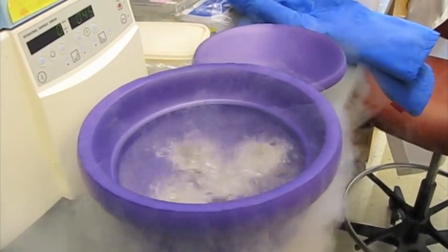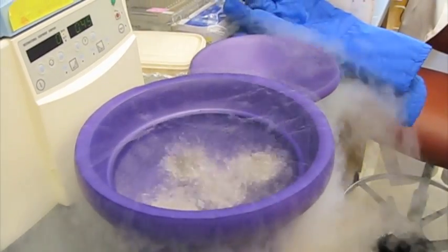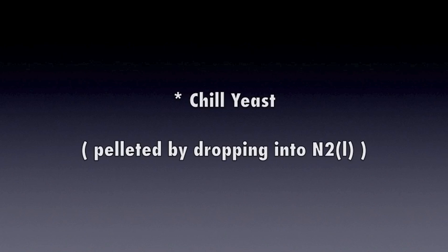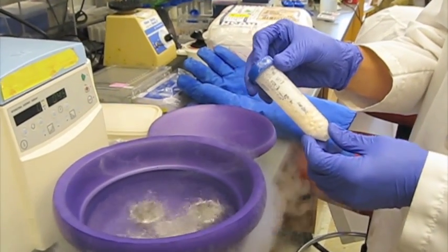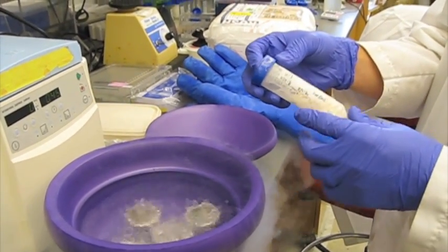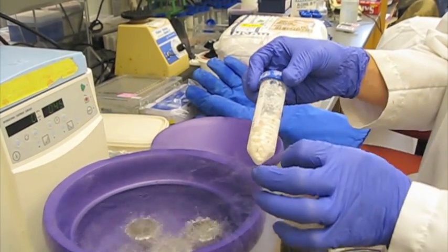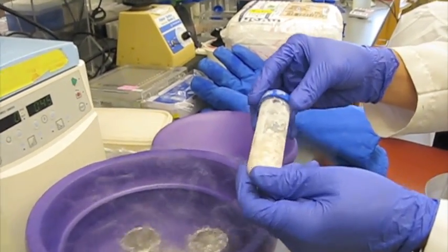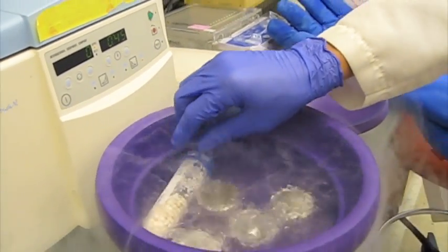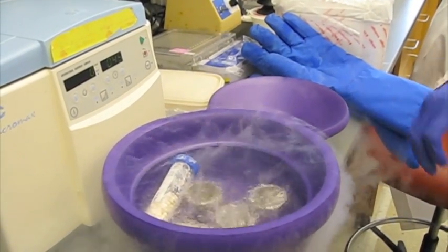Once the bubbling stops, that's when you pretty much know that it's come down to temperature. So this is the yeast extract we're going to be lysing. This is a 2-liter culture grown to an OD of 1.8, and it's been compacted down to about 10 mils where we've dropped it into liquid nitrogen to give these nice solid pellets. We're going to keep this cold — it's in a nice form that allows it to be easily busted apart.